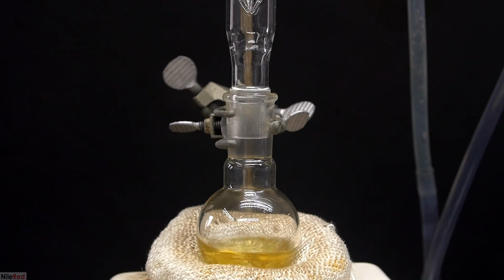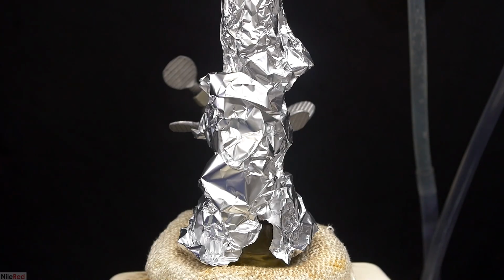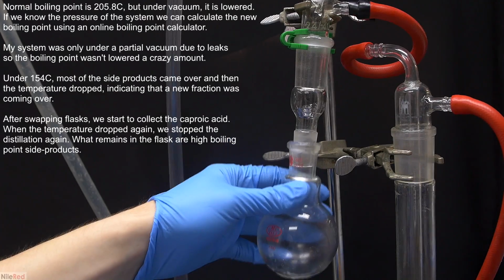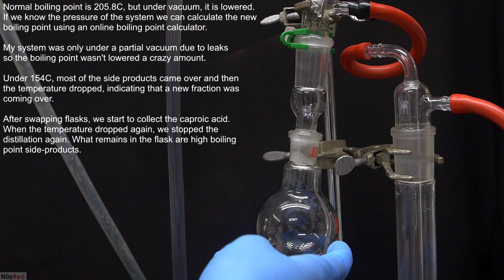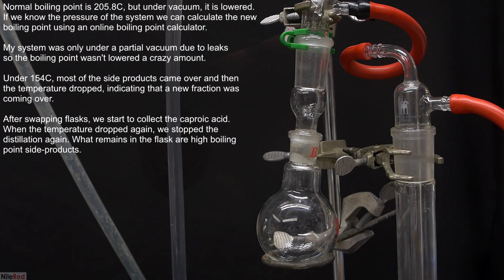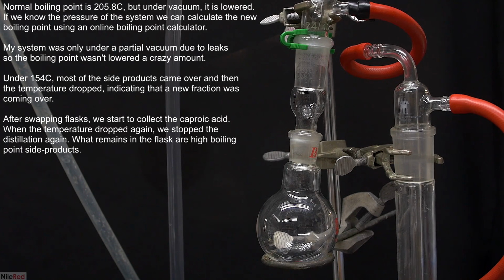I transferred everything to a 100 milliliter flask, and I set things up for a vacuum fractional distillation. I pull a vacuum on the system, and then I start the distillation. Things start to slowly trickle over, and I discard everything that came over around 154 C. Once I got to the 154 Celsius mark, I swap the flask out for a new clean one. I pull a vacuum again and start the distillation, and at this point, we're collecting our caproic acid.